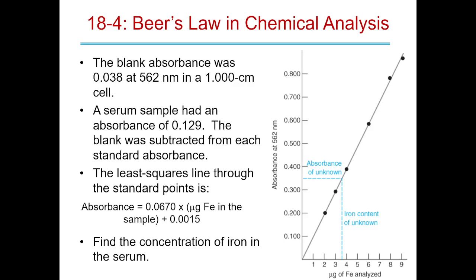The two major ways they do that is they either measure it in the bottle if they can, like glass bottles, that works really well, or they take samples out of the batches. There are big mixing containers somewhere along the steps, and they typically have a long straw-looking thing, kind of like a volumetric pipette, but really big and long. They suck a little bit out and take a spectrum. If there's something wrong with that, they get rid of that batch, go to a new one, and try to figure out what the hell's going on.